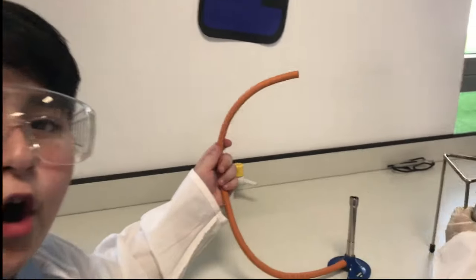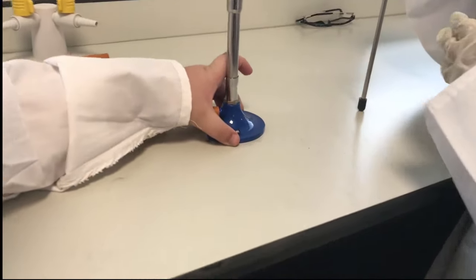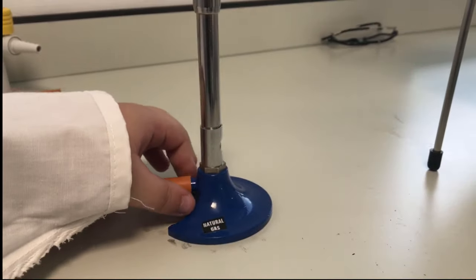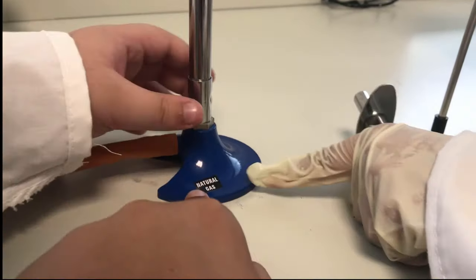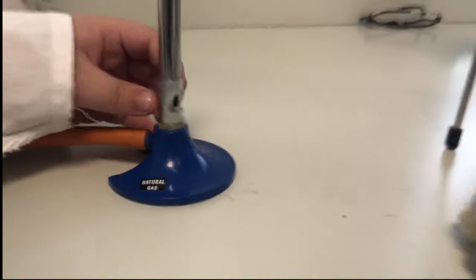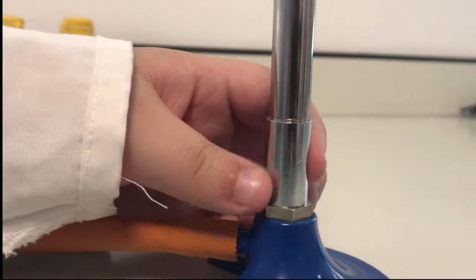So let's start by telling you the parts of the Bunsen burner. The gas pipe or the hose, some people call it, then this is the metal base, the bottom one, the blue one.